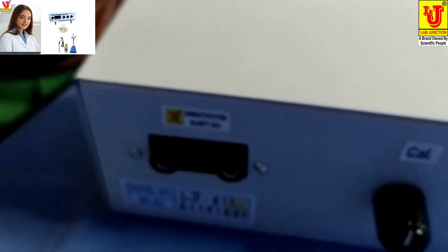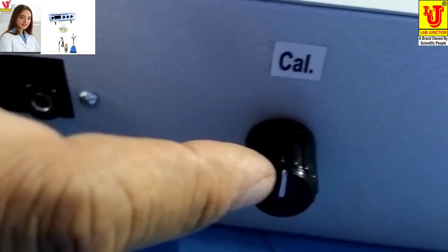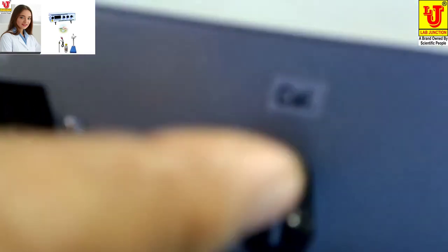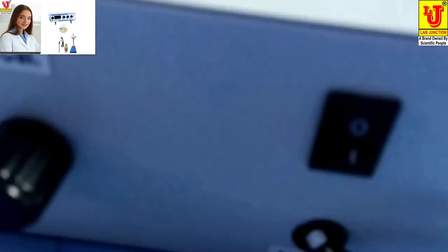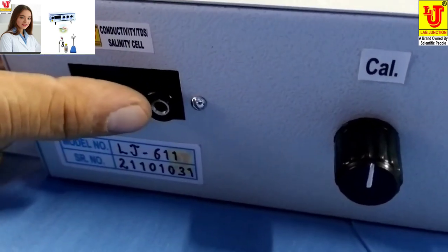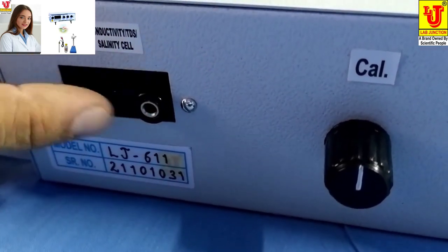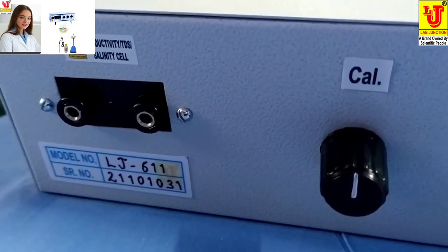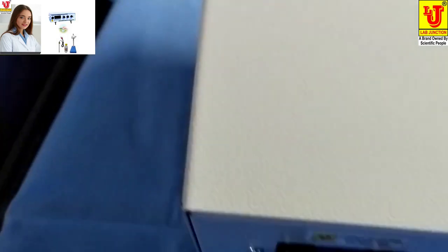In the back side, one control is for check position, one is switch off, and third one is Banana Sockets for Conductivity Cell.